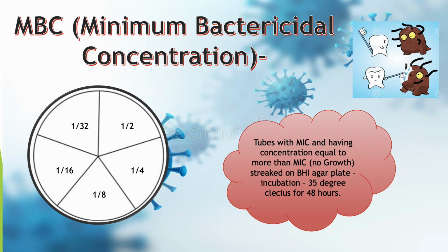The experiment was conducted in duplicate, providing valuable insight into the bactericidal potential of EETC, contributing to a comprehensive understanding of its antimicrobial properties against Streptococcus mutans. However, the pictures describing the results of the MBC will be described in the results section.